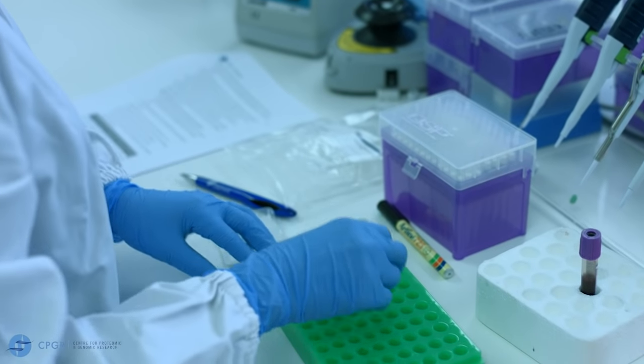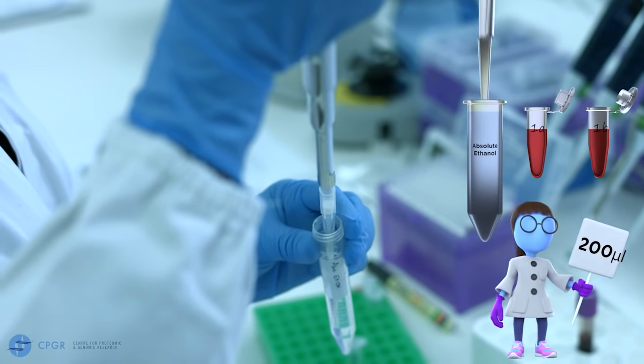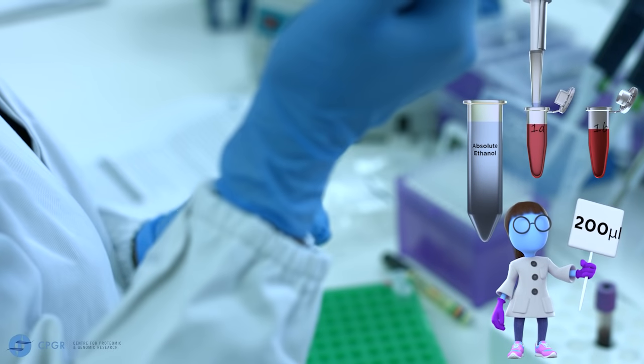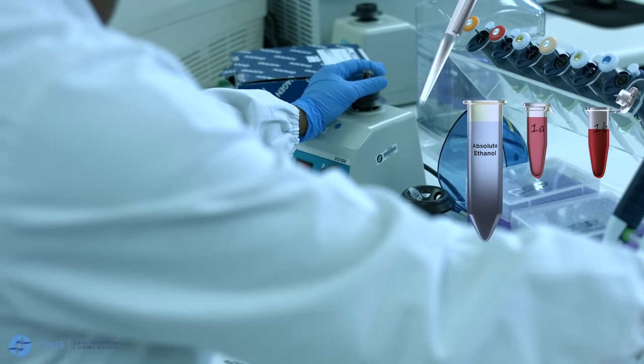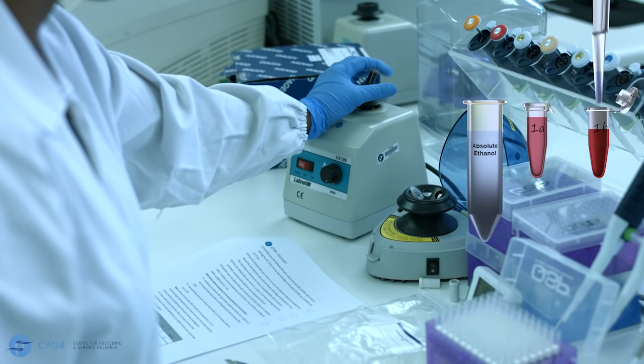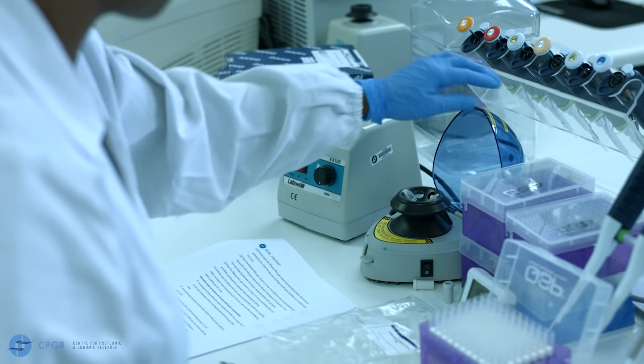Add 200 microliters of absolute ethanol to each microtube and mix each sample by briefly pulse vortexing for about 15 seconds. Briefly centrifuge the microtubes.